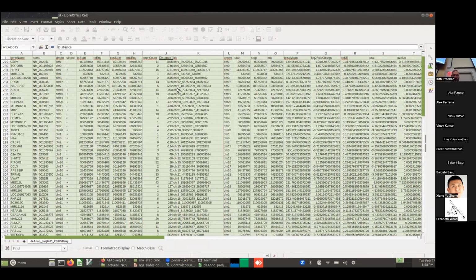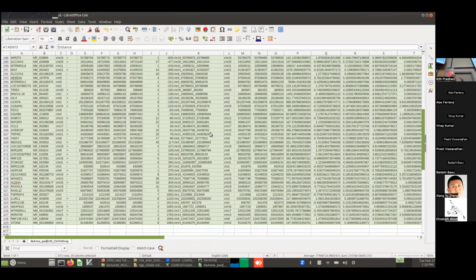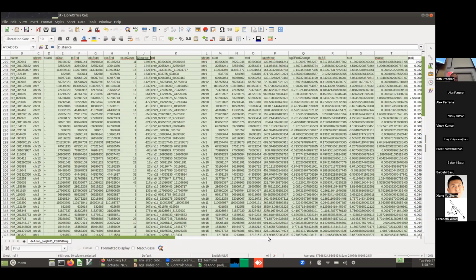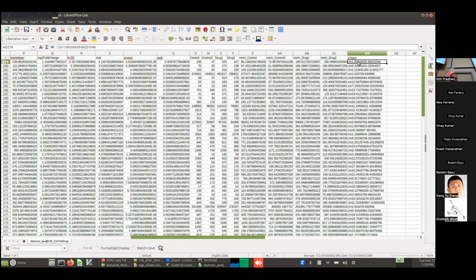So it's just a short list of genes or peak regions that show differential signal between the two experimental conditions. And that generalized function, as I mentioned before, tacked on a little section right at the end, a column called chromosome position. This is something you can open up and use to navigate in any of your downstream analysis. I'll just show an example of that.